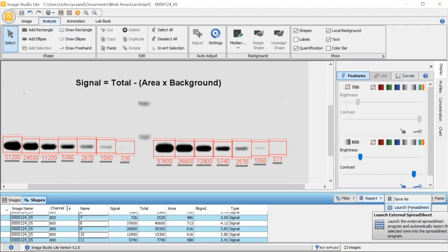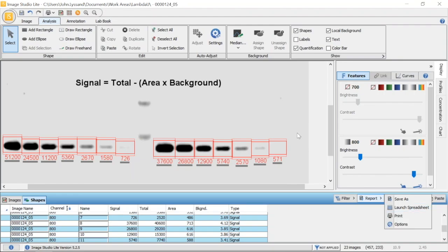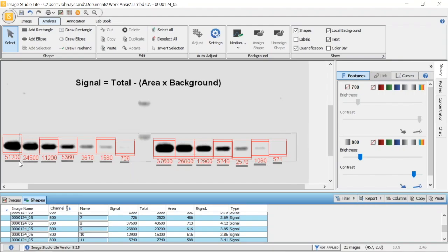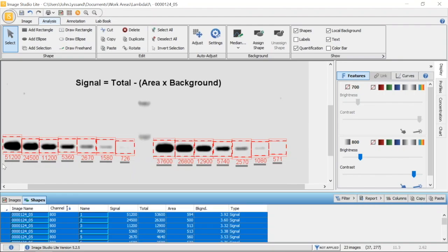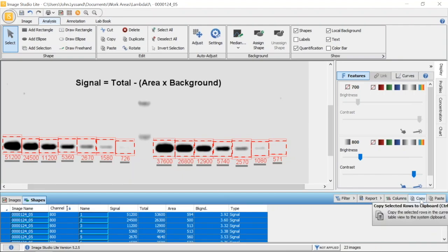If you don't have Microsoft Excel, go to your data, select the data you want to export, come to your table and hit Copy. Then go into a program of your choice and hit Paste to paste the data there.